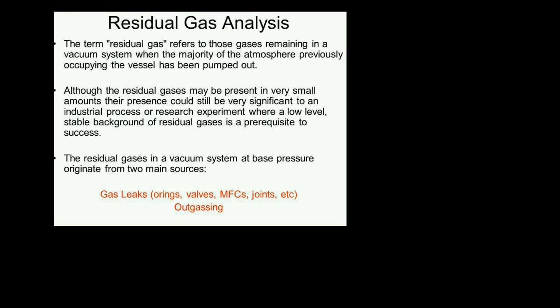So even though those residual gases may be in tiny concentrations, in very small amounts, their presence could still be very significant to your process, or to your research experiment, where you require a specific target level of residual gases in the system. The main application of residual gas analyzers is for people that are routinely trying to bring their system back to a residual gas environment that is consistent day after day, so that they get a consistent process or a consistent experiment.